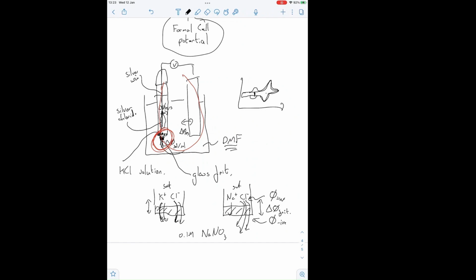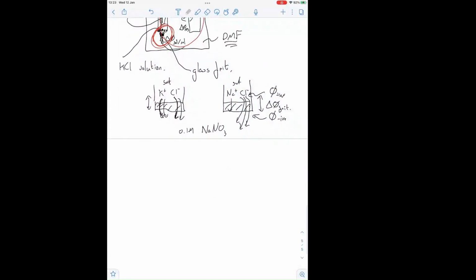So selecting the right reference electrode is important. In the Imperial College Library, there is a book, a very old one, by Ives and Janz, called Reference Electrodes. And if anybody's struggling with a reference electrode, it's worth a look. We did some very accurate work with Mary Ryan, one of her postdocs. She was trying to do very, very accurate measurements where she wanted to vary the potential by about 1 millivolt, 2 millivolts.